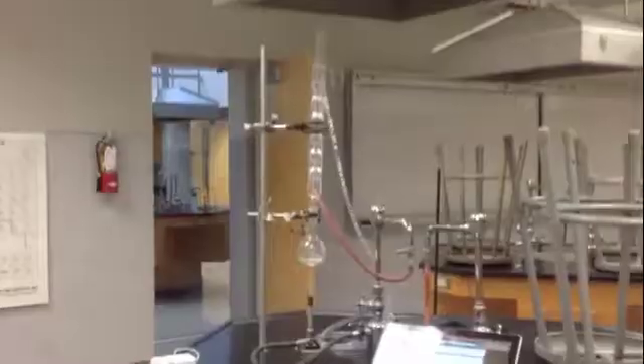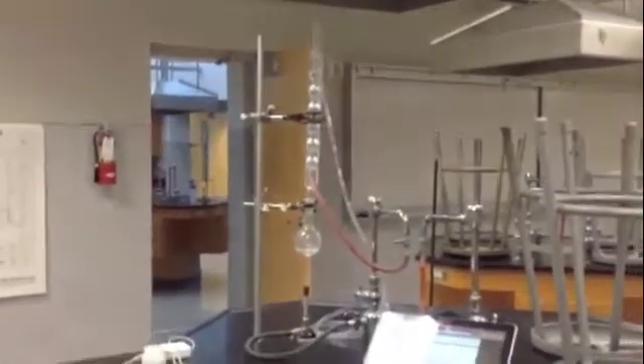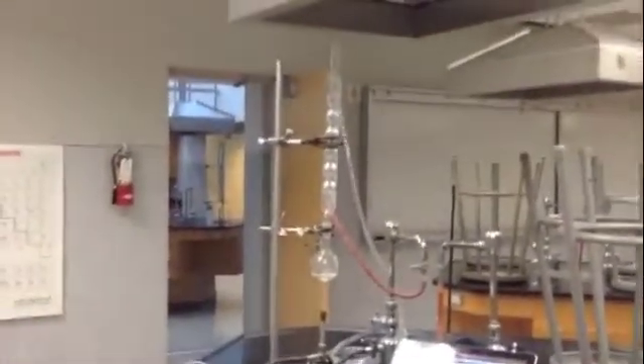Here, I'll prove it. I've mixed the chemicals together in the proper proportions, and they're now in the bottom of that round flask.